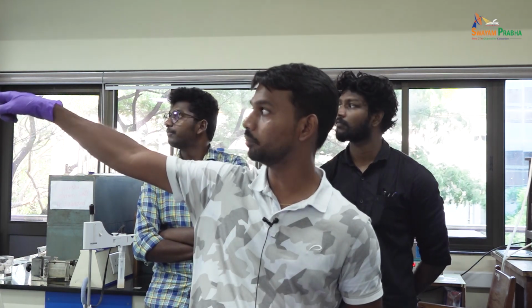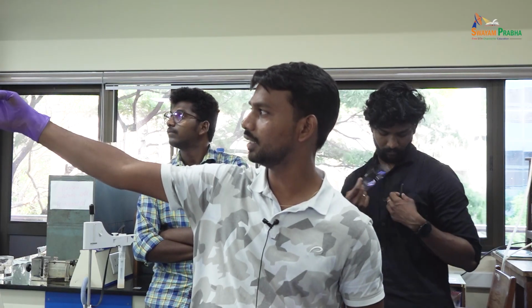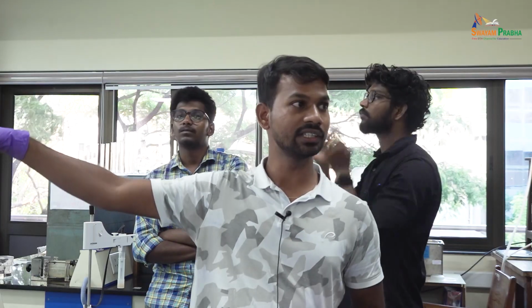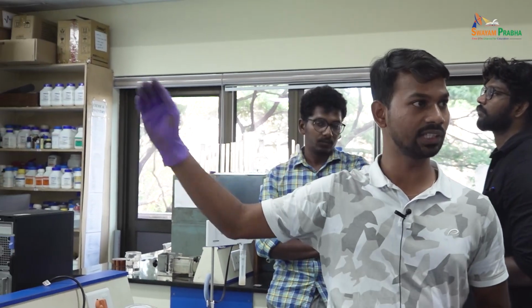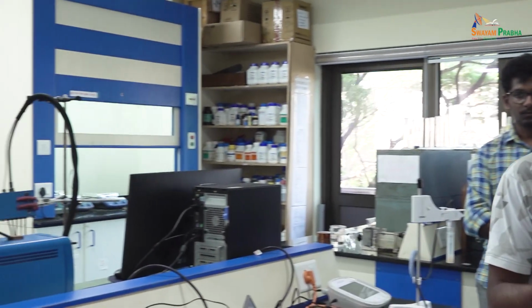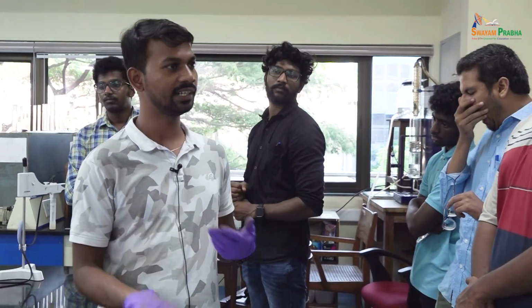Say suppose I am doing corrosion studies for bipolar plates. Can you see the two potentiodynamic curves there in that poster? I think the left side one is the cathodic condition, for which I will purge oxygen. The right side one is the anodic condition, for which I will purge nitrogen, to simulate anodic and cathodic conditions. Purging through the electrolyte removes the oxygen, to deaerate the solution.